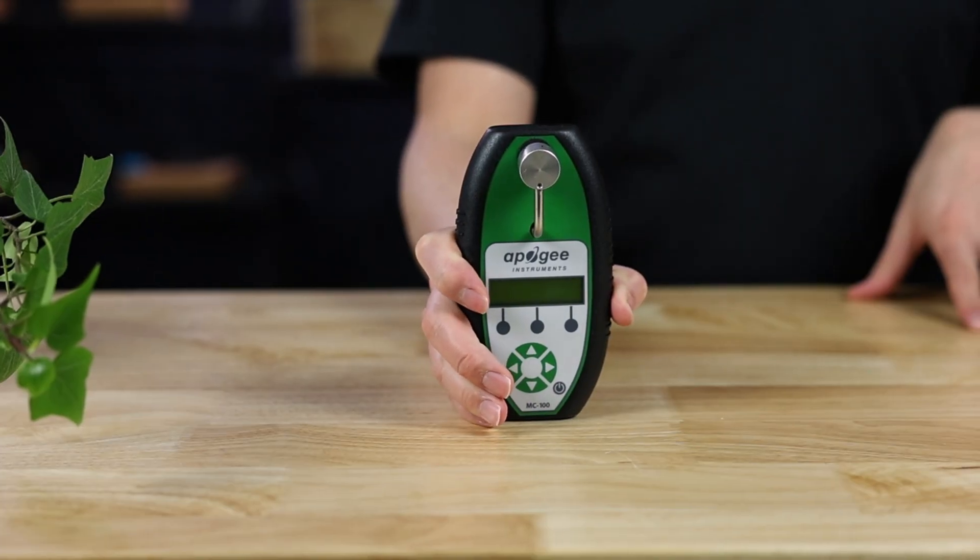This is the Apogee Chlorophyll Concentration Meter, and if you wanted to monitor your plant's health, then this is an incredibly handy tool.